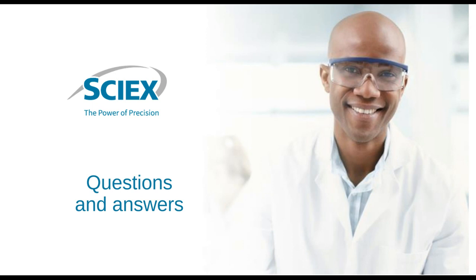Perfect. Some great tips to share. We do have another workflow related question. So after extracting DNA, is there any special sample treatment or preparation before going for analysis on the CE?